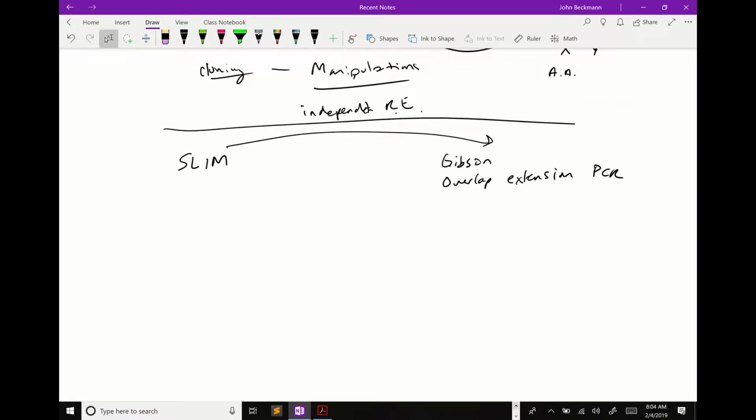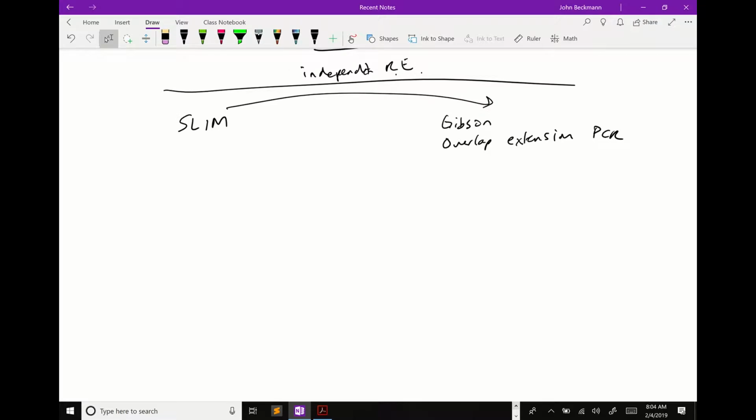Are the scars basically ones that don't go away? Yeah, so let me show you the mechanism of how they get added in. Let's say you want to clone X. You design your primer, and we talked about how you need to add that restriction enzyme site. So we'll do BamHI, GGATCC, and on this one we'll do XhoI, CTCGAG.